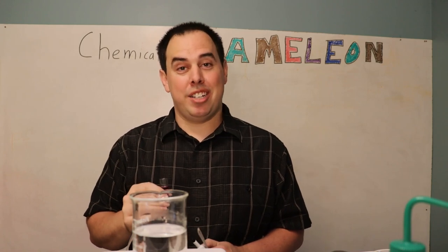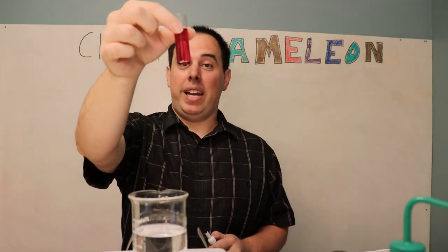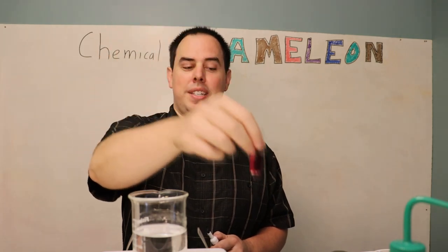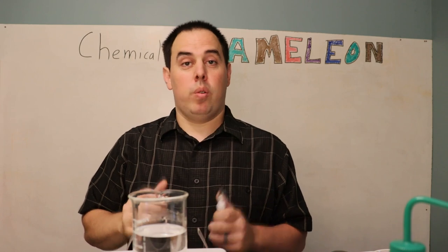I can't think of a better way to showcase oxidation numbers than through the Chemical Chameleon demo. We're going to be using potassium permanganate which is this lovely purple color since it's dissolved in water, and we're going to mix that with a sucrose solution or sugar water.